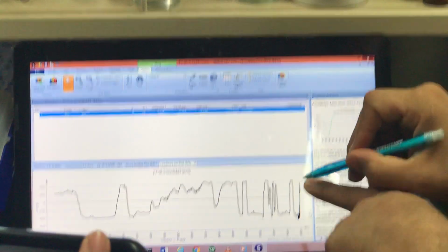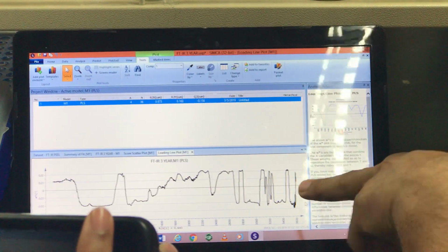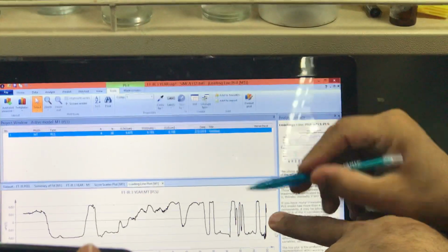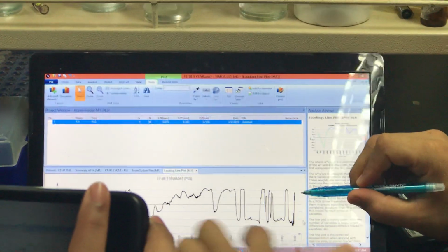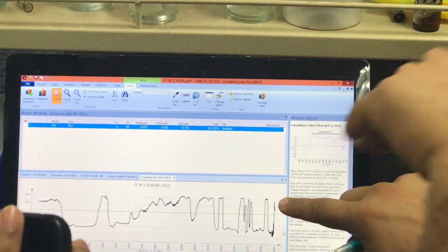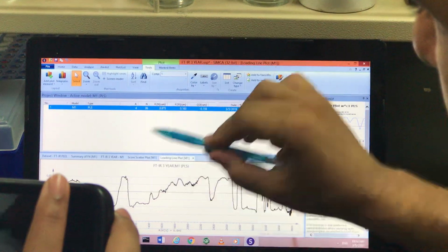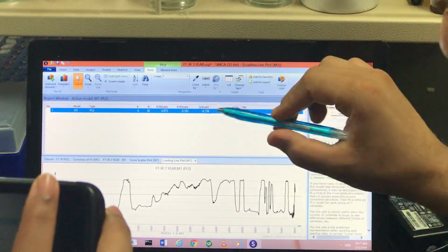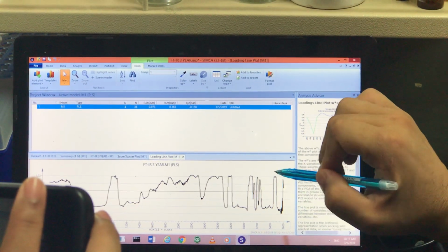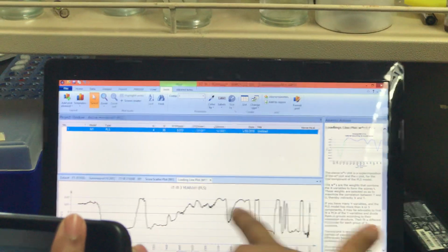You can see this is the line. Usually we use the IC50 value. For publication, we don't use the inhibition, only IC50. That usually we take the down one. But in your case, we use the inhibition. That means we'll take the up one. And you see here this C double bond O, no, CH. And here, I think this is one C double bond O, CO. This is the active fraction group.